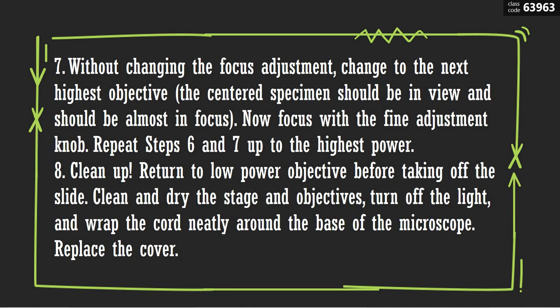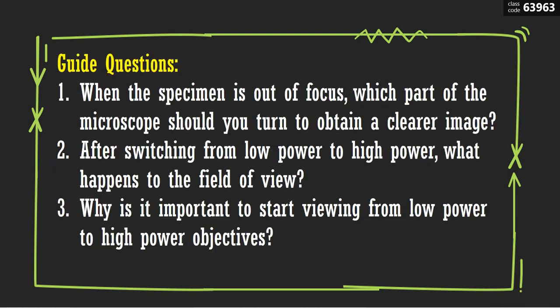Clean up. Return the low power objective before taking off the slide. Clean and dry the stage and objectives. Turn off the lights and wrap the cord neatly around the base of the microscope. Replace the cover. So that's it.